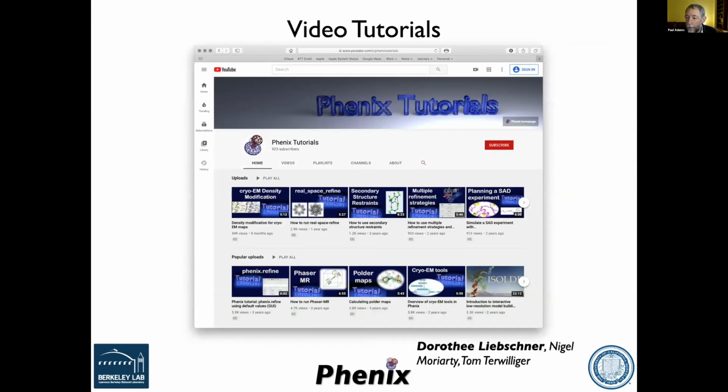So it's great that you're all participating in this workshop, but there are other ways to get information about the tools in Phenix, and one of those is this YouTube channel, the Phenix Tutorials YouTube channel, where there are a lot of videos, short videos, about 5 minutes, that tell you about all sorts of things in Phenix. Not everything, but a lot of things. And this is a great place to start, or to remind yourself about the basics.